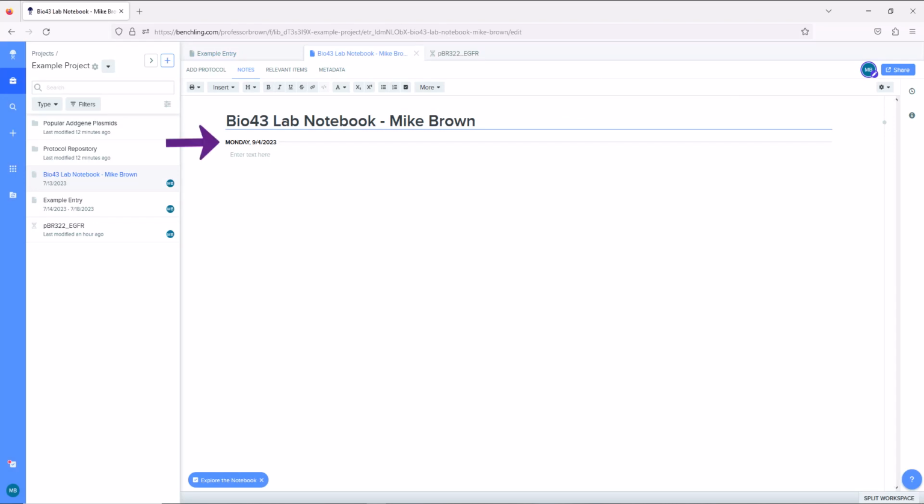Today's date has already been added, so first thing we need is a title. This should be more descriptive than just something like Cell Biology Week 1. In previous videos, we've talked about comparing Tetrahymena from the lab and Fake Lake. We can use that as our example here. So we'll title this entry, Effect of Tetrahymena Source on Cell Size.